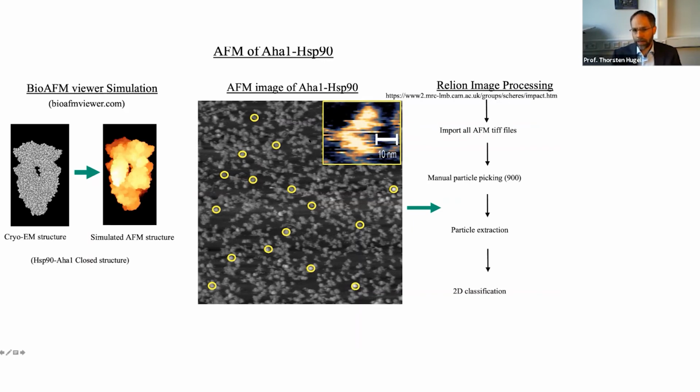Then you can take the AFM images with better and better resolution, and especially with higher velocity. And therefore, you can get more and more images. As we also heard sometime, in the image of one of these proteins that is attached to the surface, and it shouldn't be attached too strongly because otherwise it will denature, it will always be a little bit blurry, because it's a soft thing there. But now you could use many of them maybe and get something better.